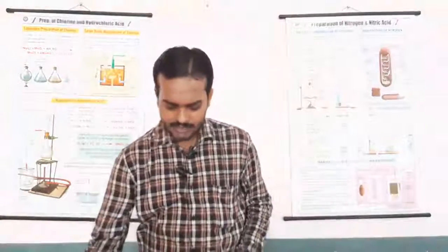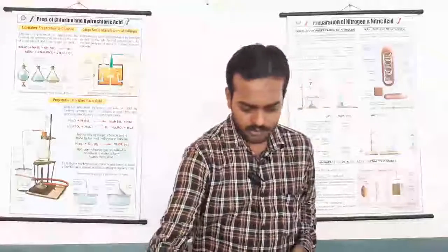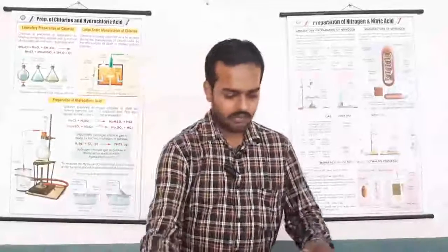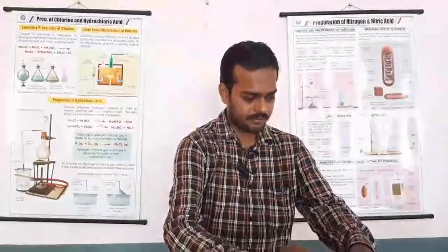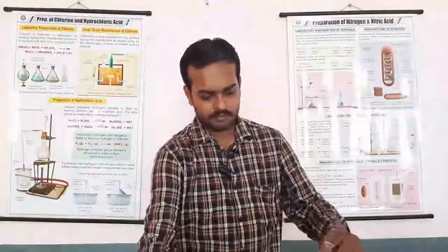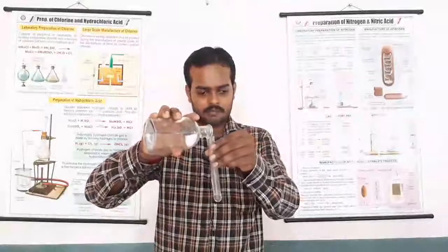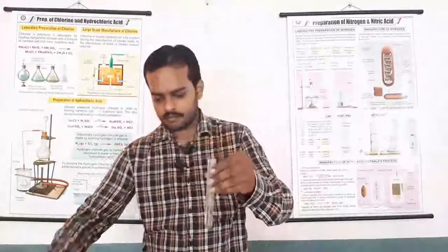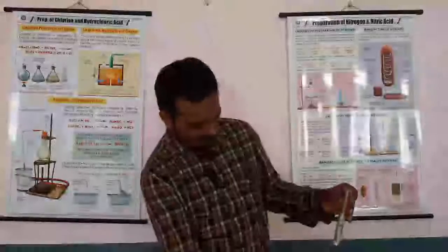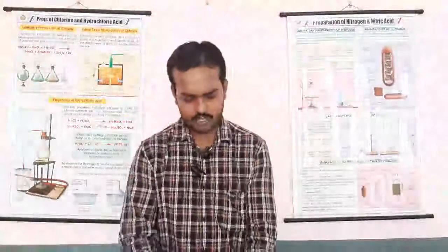What happens when acid reacts with sodium carbonate or sodium bicarbonate? So, we have a very small quantity of acid. We have taken this acid, and to this acid we will add a small quantity of sodium carbonate. Let us see what happens.